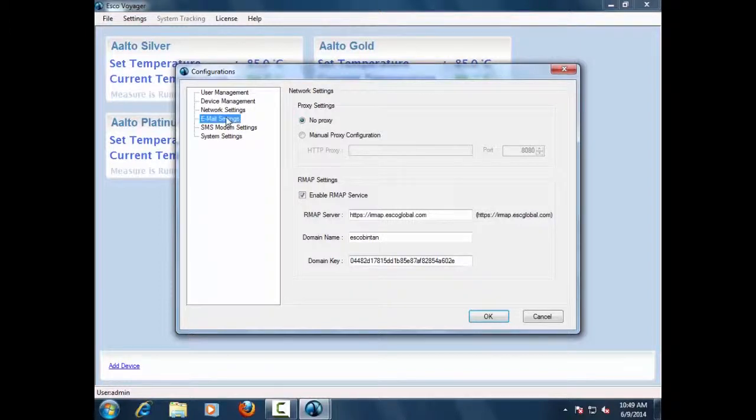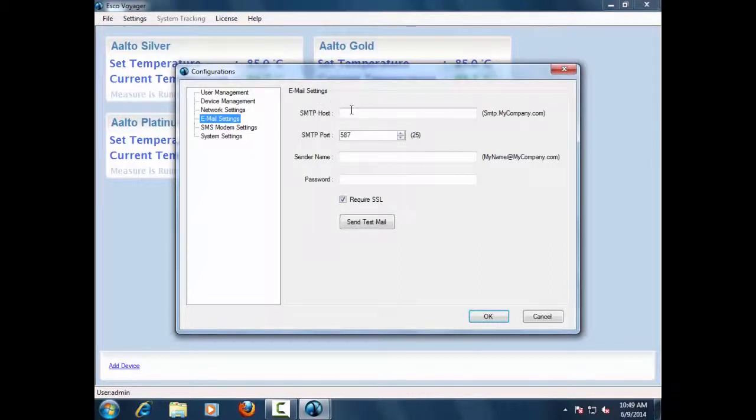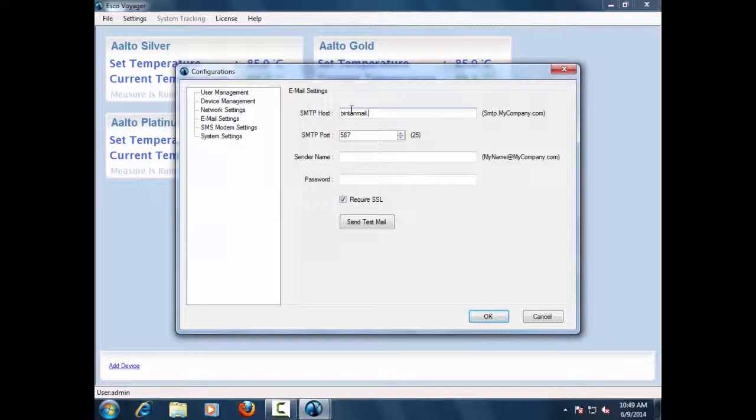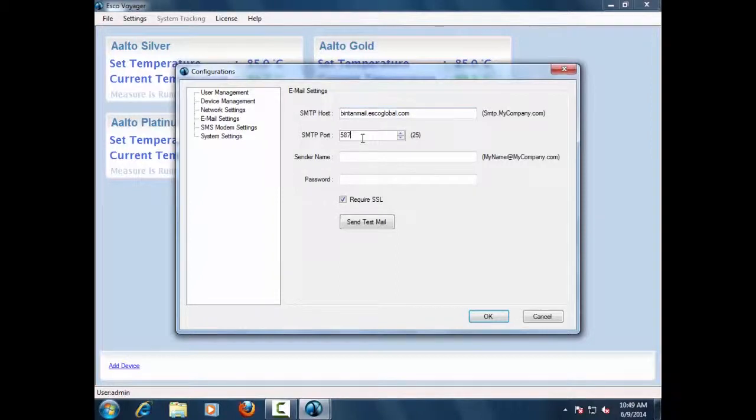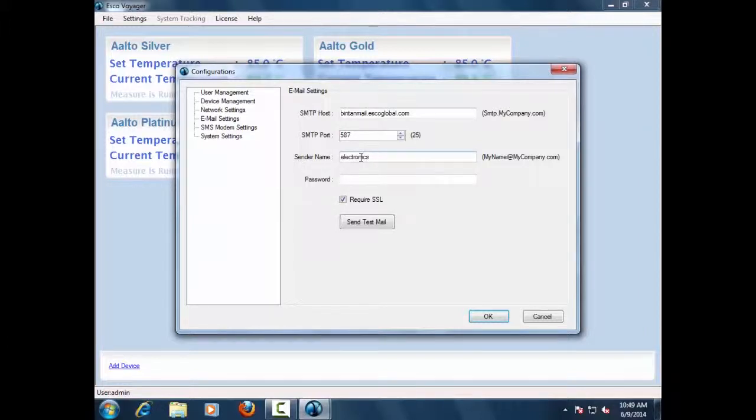Email Settings. The email settings tab consists of settings that will help Voyager application send email alerts or data logs to the designated user. Set email settings for data logs and email alert services consisting of the SMTP host, SMTP port, sender's name, password, and required SSL.